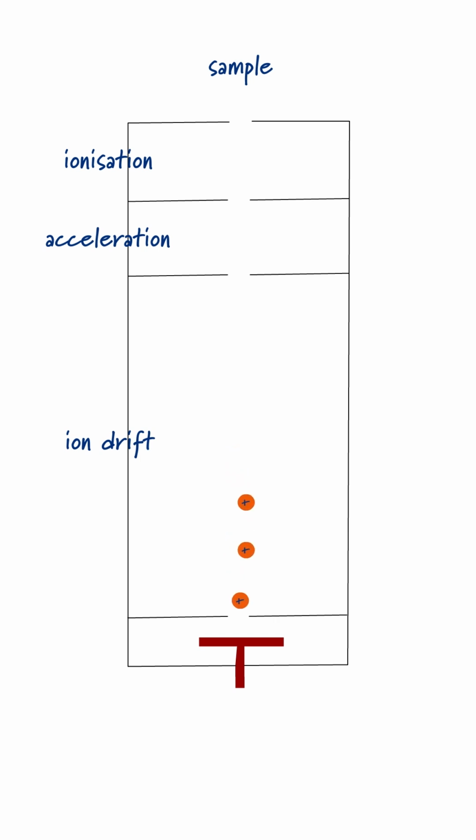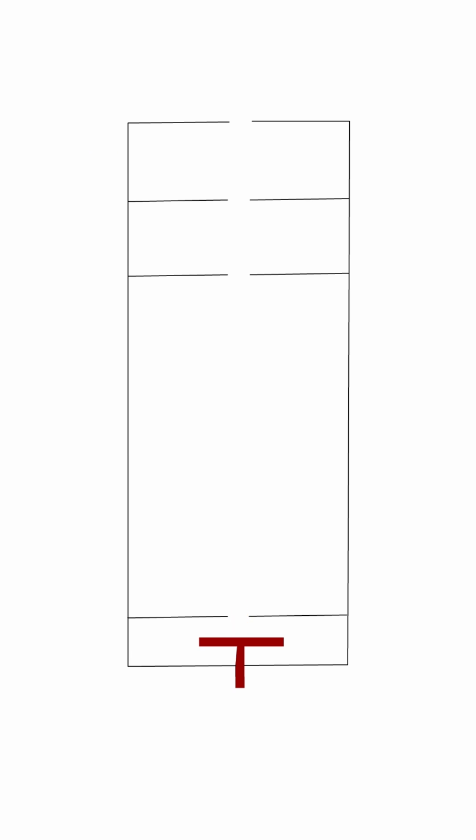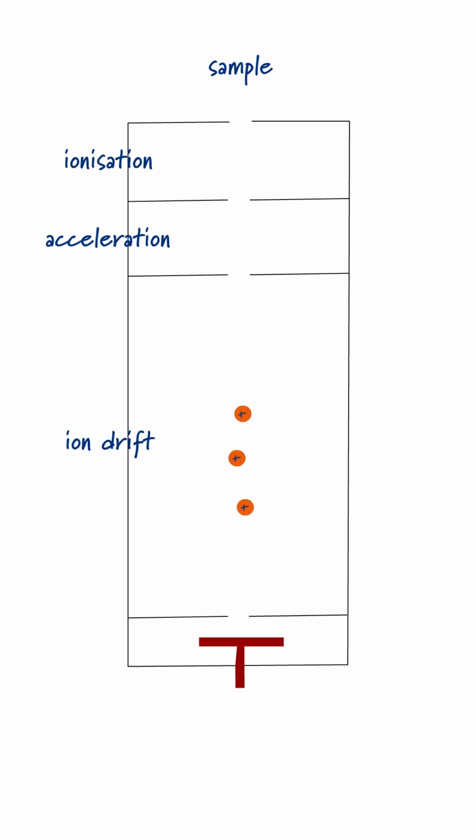The time-of-flight mass spectrometer is a simple piece of apparatus. Essentially, a sample of an element is injected into the spectrometer, and the atoms are ionized, forming positively charged cations. These cations are accelerated to the same kinetic energy and then released into the flight tube or drift region. We can measure the time taken for the ions to drift through this vacuum. The vacuum simply prevents ions colliding with air molecules.